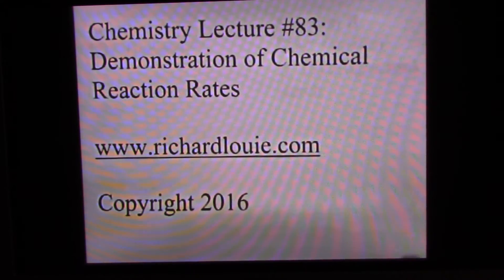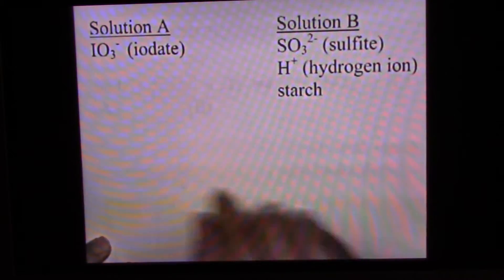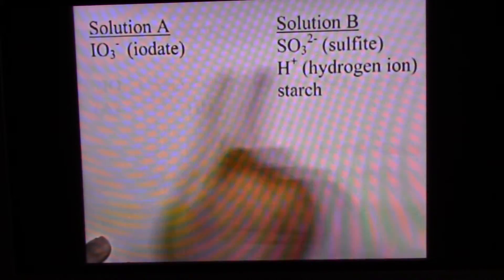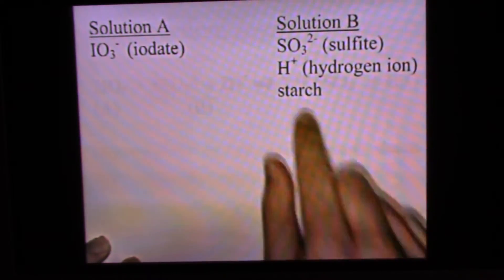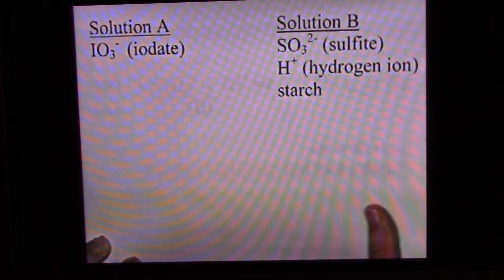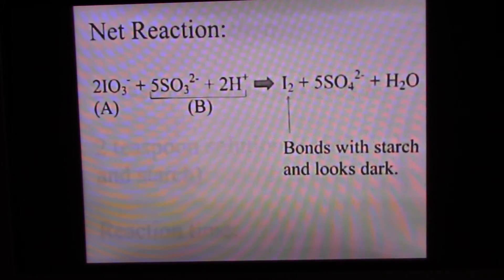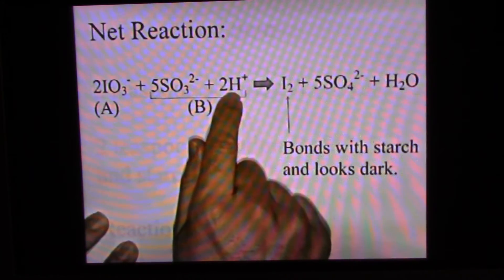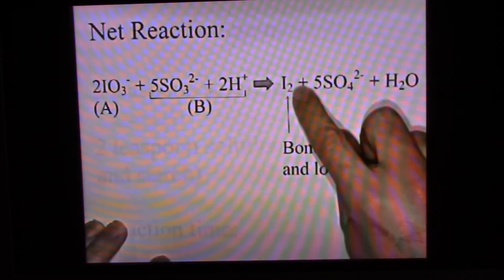We're going to mix some solutions — two solutions. One has iodate, and the other has sulfite, hydrogen ion, and starch. When iodate, sulfite, and hydrogen ion are mixed, the elemental form of iodine is made. This is the net reaction: iodate ion in solution A mixes with sulfite and hydrogen ion, producing elemental iodine, which bonds with starch and has a dark appearance.